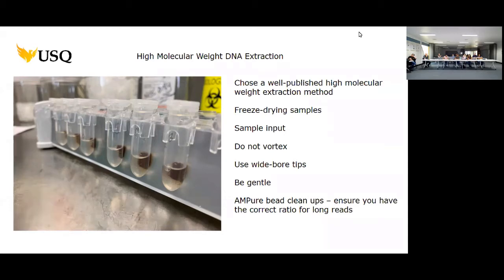If you can, use wide bore tips. We all know that pipetting shears up your DNA and you can't get away from pipetting through this, so use wide bore tips if you can and be gentle through all of the processes.